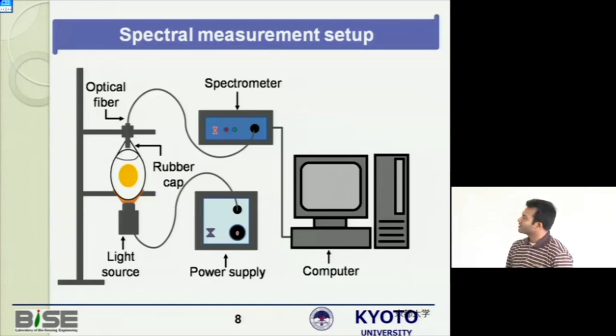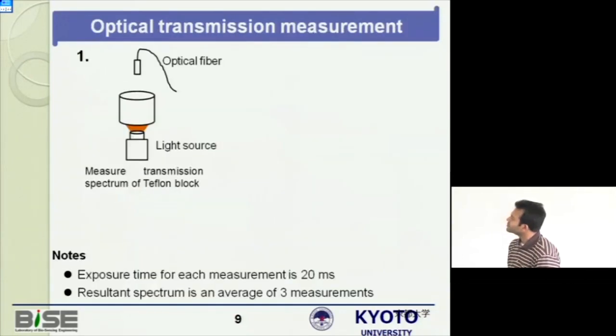We use this setup in the lab. The optical transmission measurement procedure is an everyday measurement.